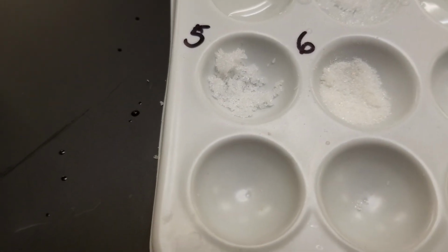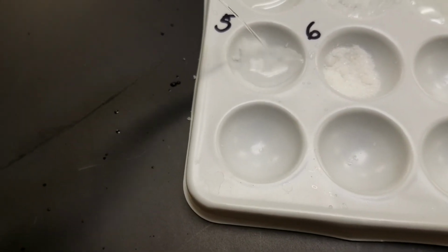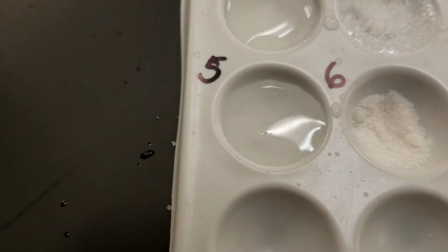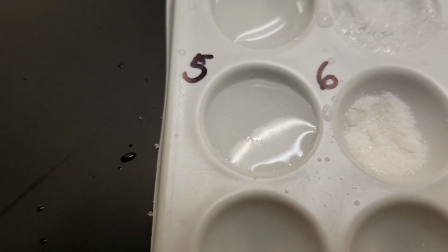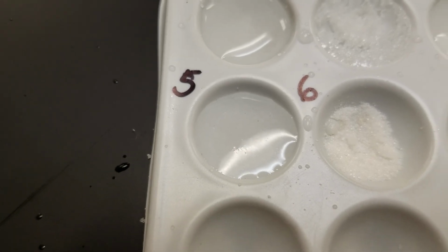Let's go to number 5, sodium chloride, table salt. There's still some in there, but it looks like it's mostly dissolved. So we can say that sodium chloride dissolves very well.